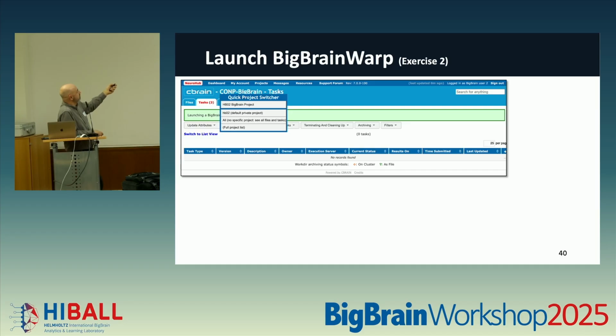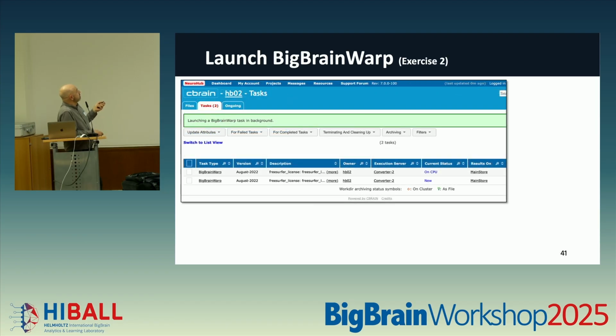I had left it with my default. But in your case, you're going to want to switch to the project that you created. Okay, and then you're going to see the view that corresponds to your project. So you should then see the CBRAIN name, the name of the project you created, and then the tasks. So that kind of gives you the task view of that project. And then from that, you should see underneath a list of tasks that are associated with that.